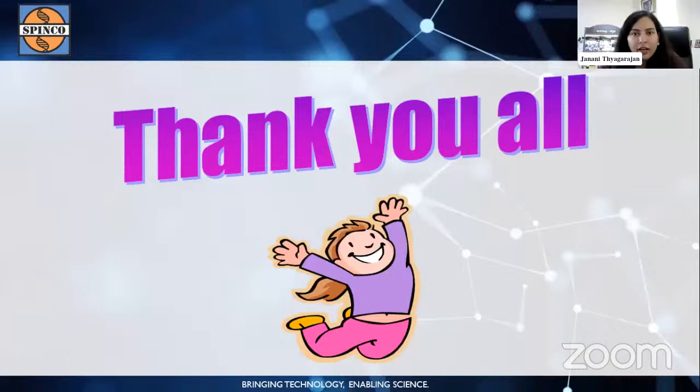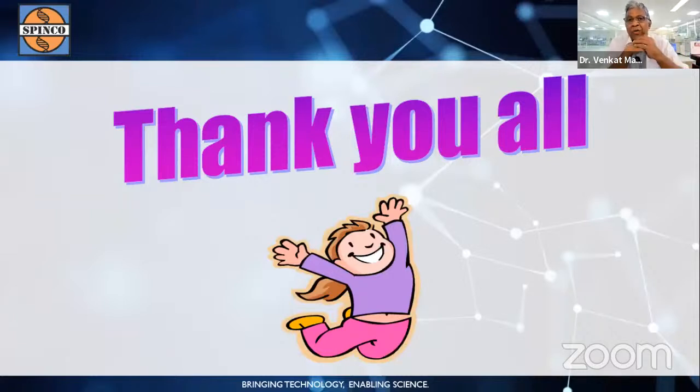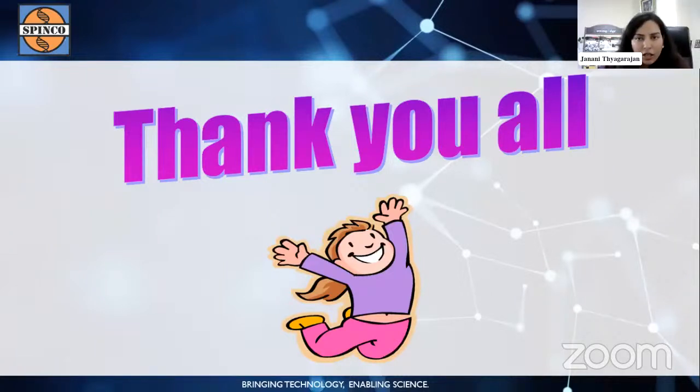Okay. And the next one is, which matrices are used for MALDI? There are more than 25 matrices. We can share that list. Literature is available.